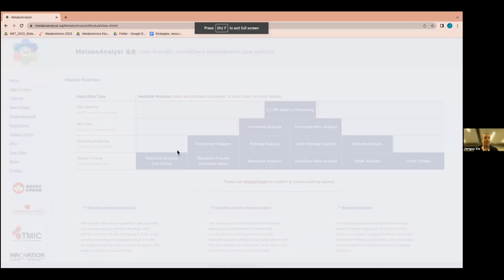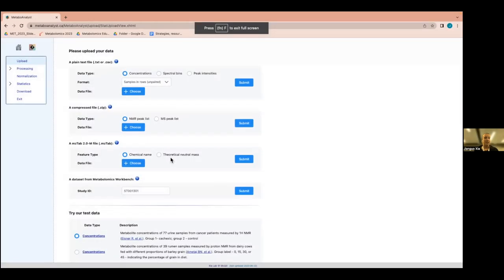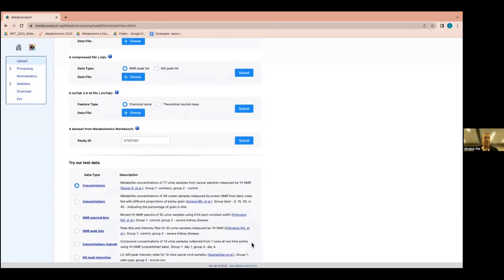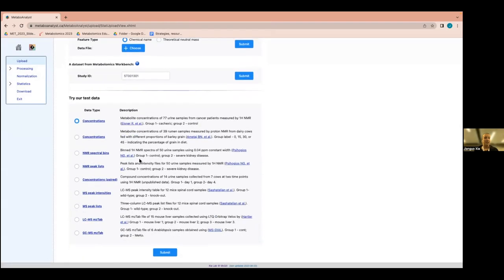I'm going to use the built-in example data, but when you do the lab you'll upload the data we processed yesterday. Try to remember generally what I'm doing. Those protocols that Jeff linked are part of the pre-reading — if you're unsure which buttons to push, they have detailed information on each method. You can also ask the TAs, but in general the defaults should be okay, except for the normalization which I'll go through.